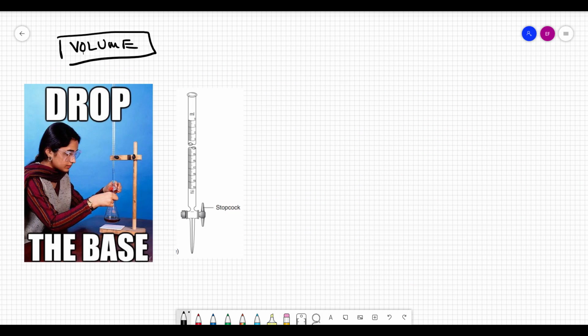So the other standard wet chemical technique is measuring the volume of things. And this is probably one of the first things you were ever introduced to as a real experiment in a general chemistry course via a titration. Right? So a titration looks something like this picture, where you have this piece of glassware, usually set up in a clamp, and there's some fidelity or precision by which you can dispense and control the amount of some liquid, we call a titrant, into a sample below.